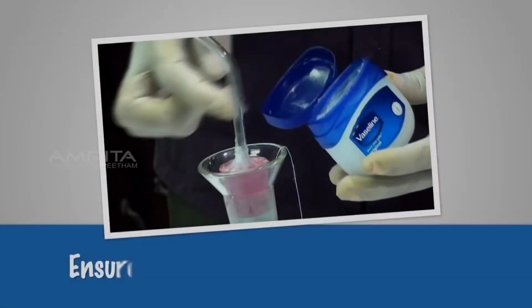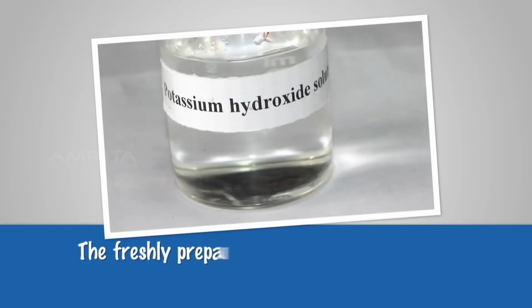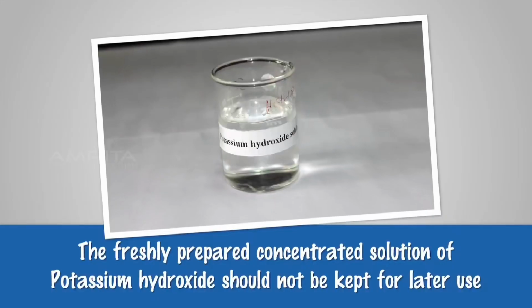Precautions. Ensure all connections are airtight. The freshly prepared concentrated solution of potassium hydroxide solution should not be kept for later use.